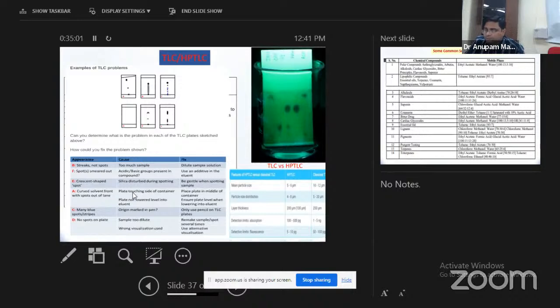So how do you prevent the ionization? We have to use an ion pairing agent. Ion pairing agents are formic acid, ammonia, and acetic acid. You use an additive in the eluent. So you can use ammonia, trifluoroacetic acid, or formic acid. These are the ion pairing agents.